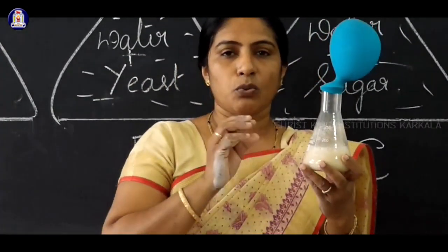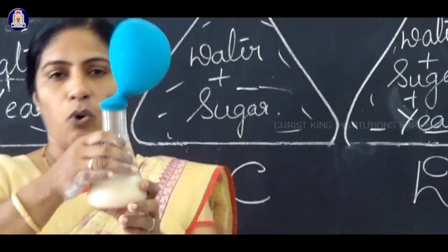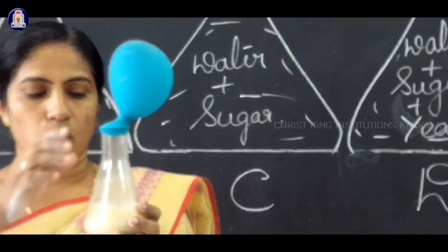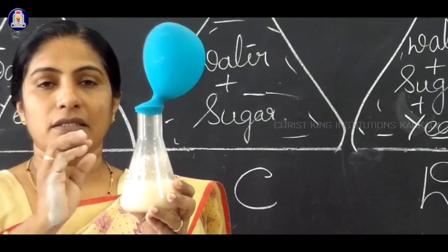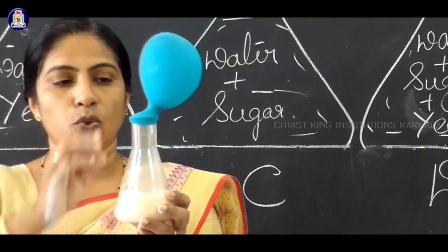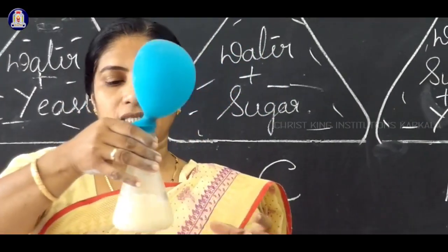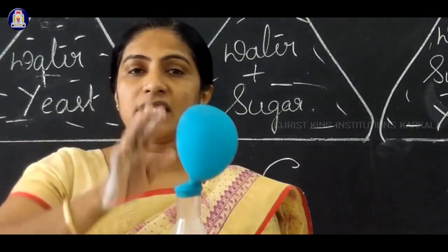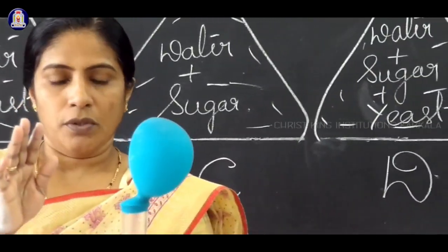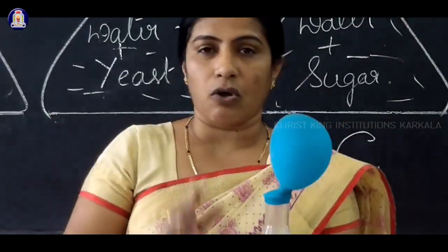When the yeast is mixed with a sugar solution in lukewarm water, it will rise, but it will not rise in cold water. The reason is it requires a certain temperature and a certain medium, that is sugar with lukewarm water. So the yeast will rise in structure and release carbon dioxide. So this is our inference. Don't conduct any experiment at home. We are conducting all the experiments here.